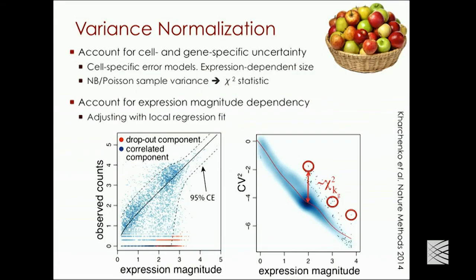So the over-dispersion analysis. Now, we don't throw out the genes. We simply renormalize the variance to calculate this residual variance, right? So if the gene is not over-dispersed, you don't lose it. You still have that pattern, but statistically it could be downweighted. Now, the problem is if you have, let's say, one uniform cluster and one heterogeneous cluster, but they're very distinct. Most of the variance you'll capture here will be the distinction between these two and not the little heterogeneity you want to see within it. So when you focus on it, you should be able to detect it better, so you're better off doing this. In the new version, we tried a couple of automatic recursion approaches, but I think we'll do a different approach. But yeah, you can rerun it.